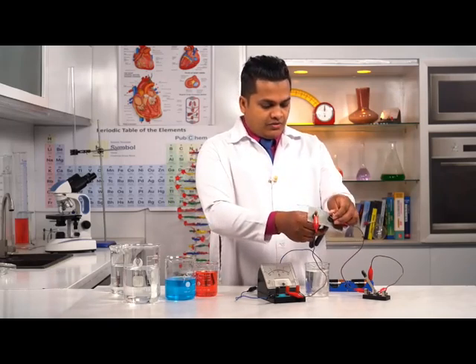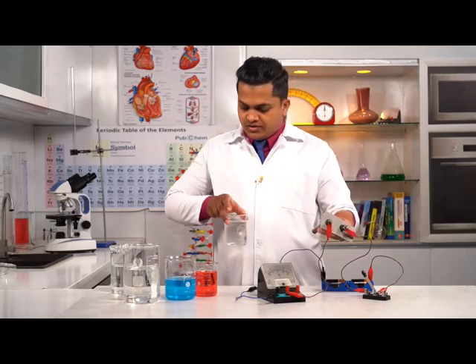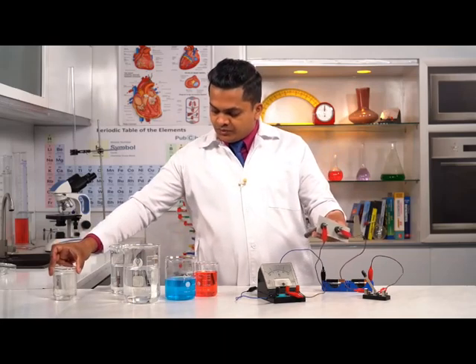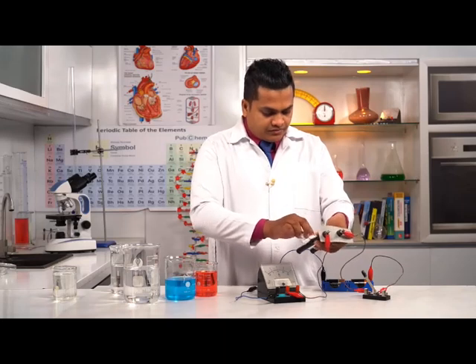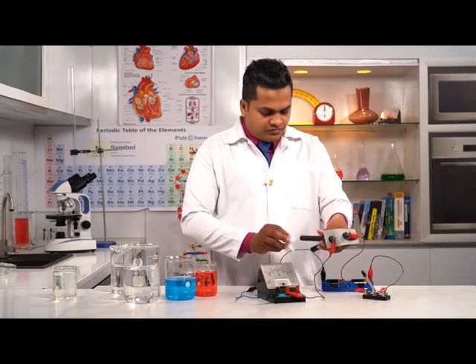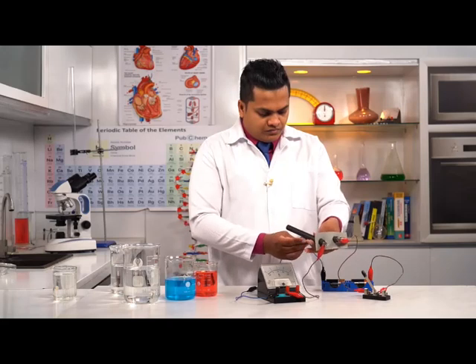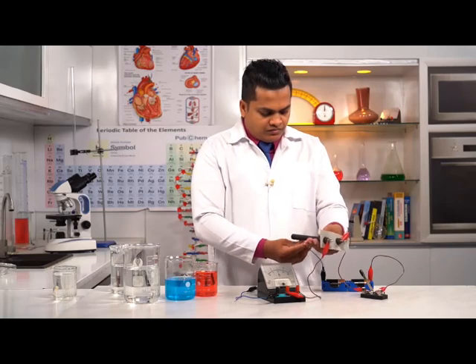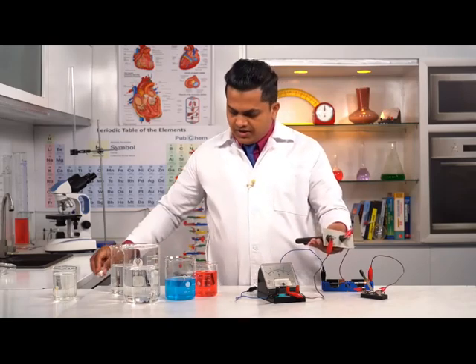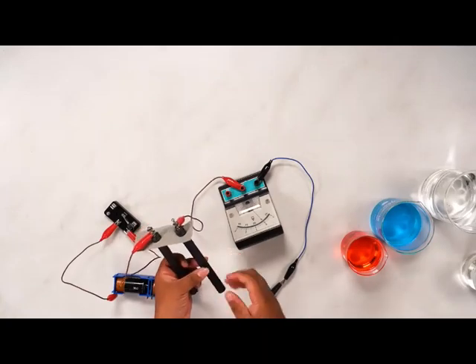Once again, we are going to take out the two rods. Let's remove the salt solution. We'll wipe it out. Now, let's take the kerosene oil.